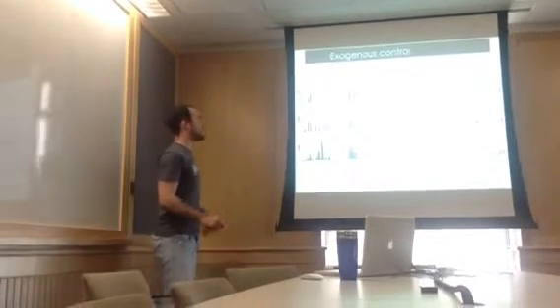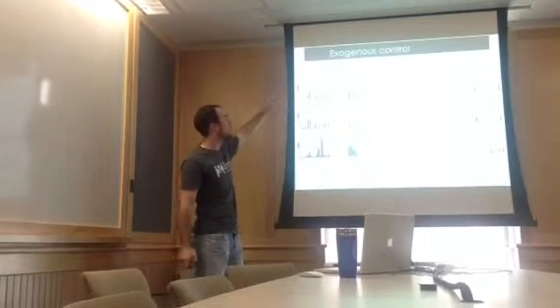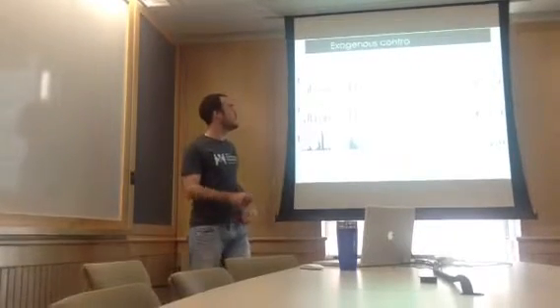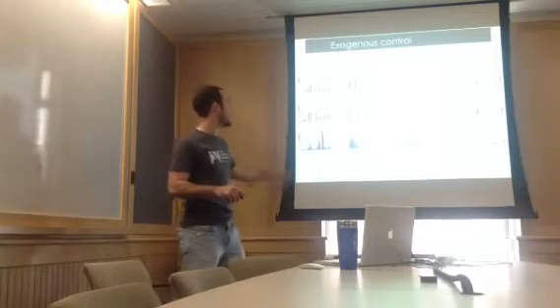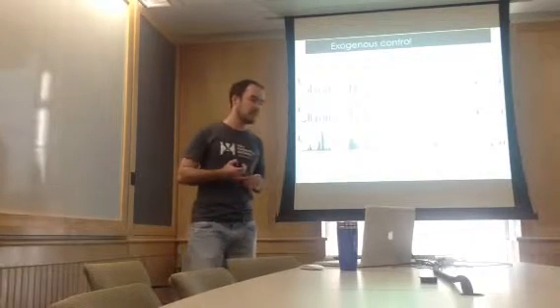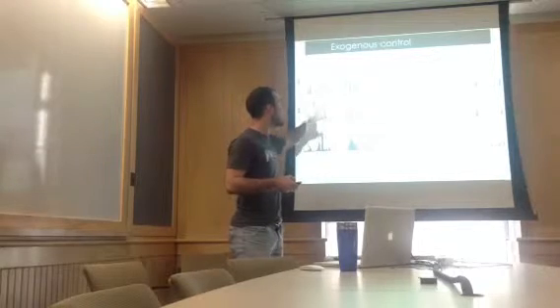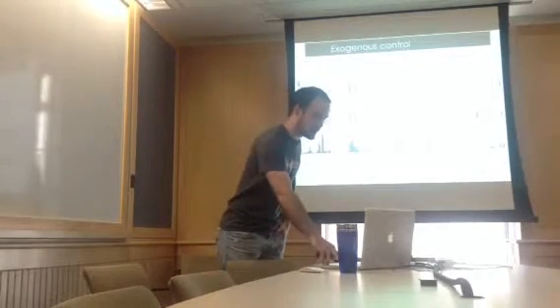And one of the first things that we can see that differ from the profile that we have seen for ribosomal RNA is that in this case, the DMS in vitro and in vivo are in really good agreement with each other. And again, the SHAPE also is in agreement with the DMS, which makes sense because we don't expect any protein or molecule or RNA to interact with our structure here, the tRNA Spinach cassette.